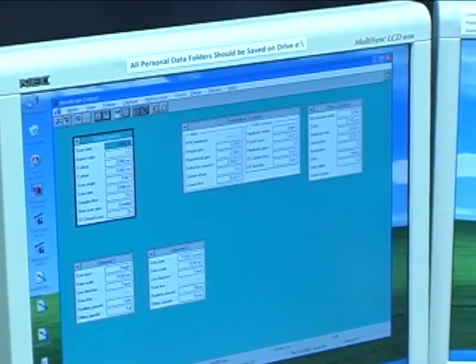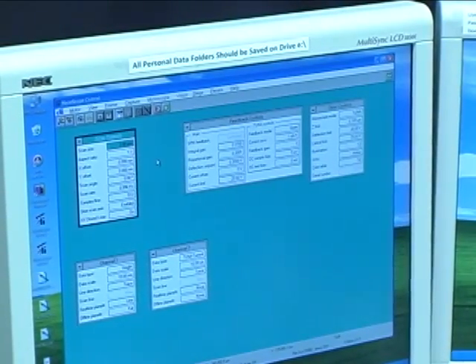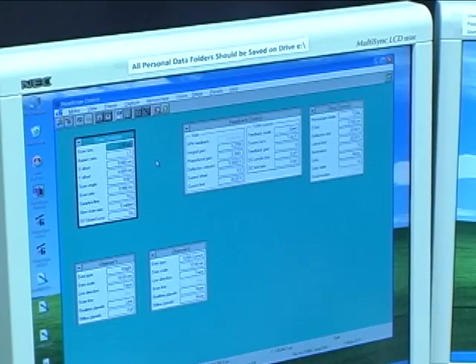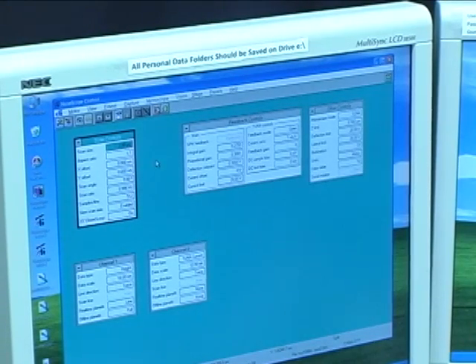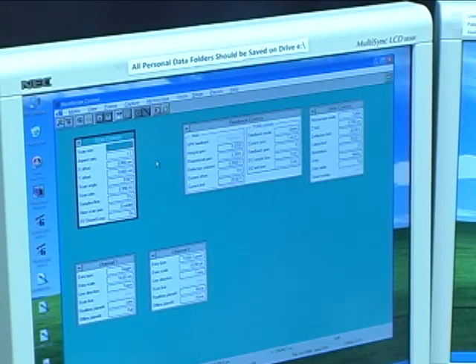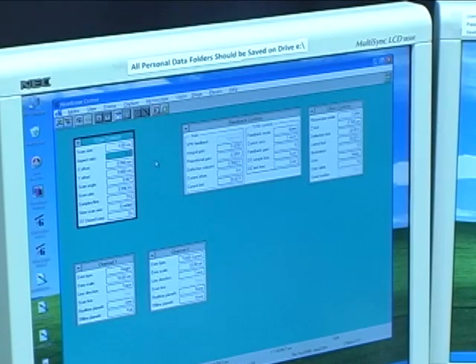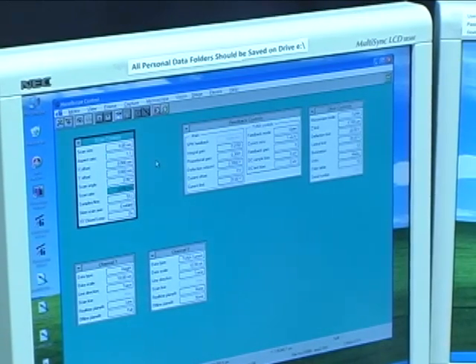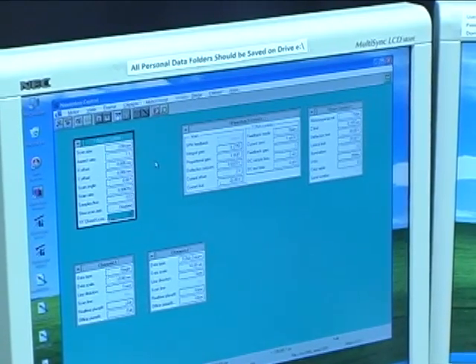And then to avoid damage to our soft platinum tip on our hard metal oxide, I will engage with the scan size set to zero so that the tip will come down and sit on a single point rather than coming down and scan. And I will also turn off the slow scan axis.